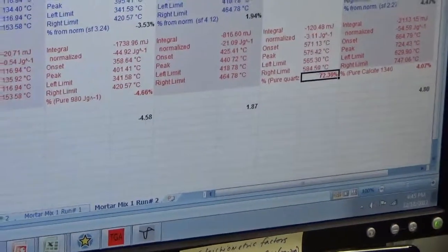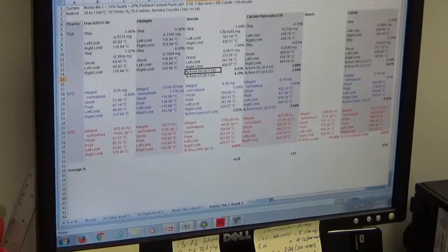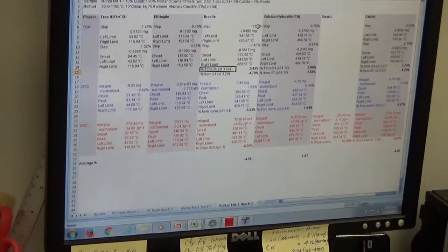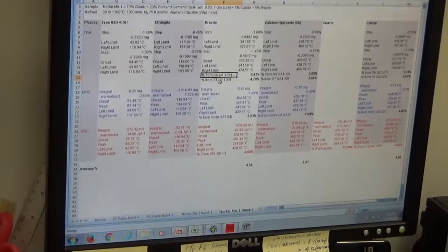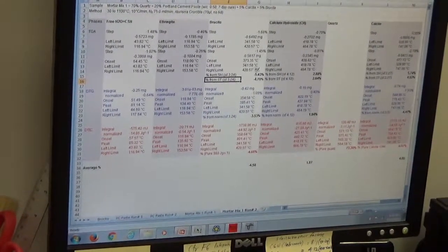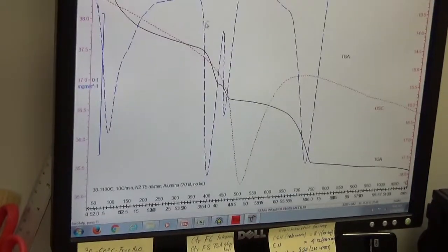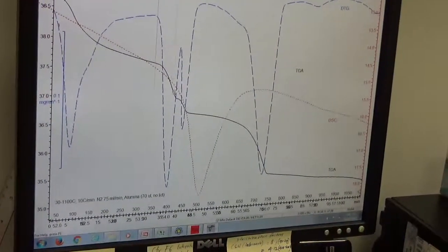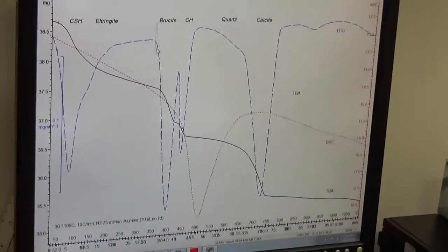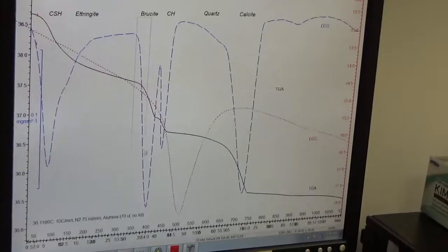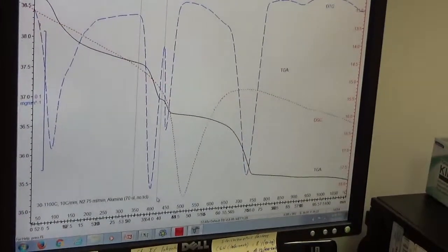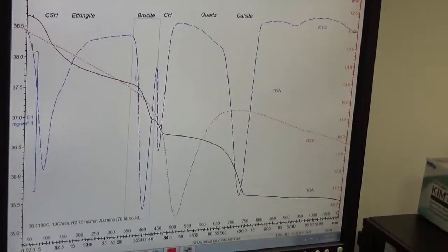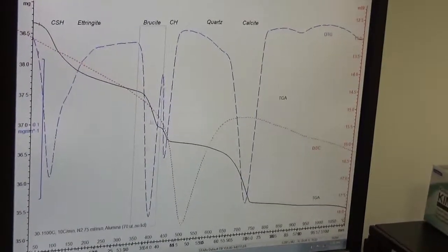The same way we can get the brucite content. We get the weight change from the TGA curve. To get the brucite content: if you concentrate on the dashed blue DTG curve, we go from one end to the other of the downward peak to get the area covered by the DTG curve for the brucite endotherm.